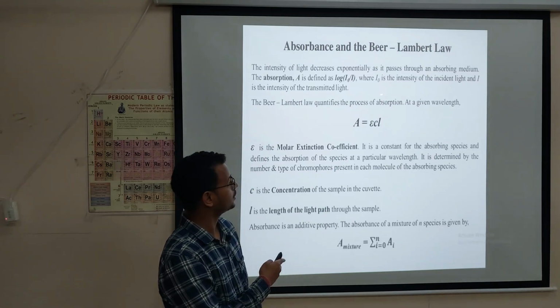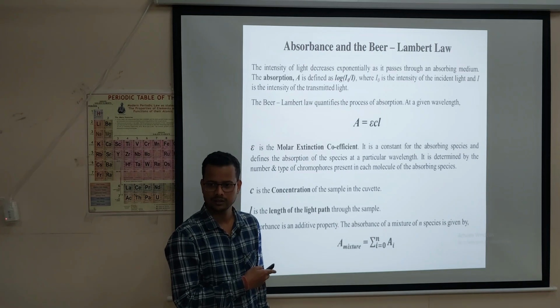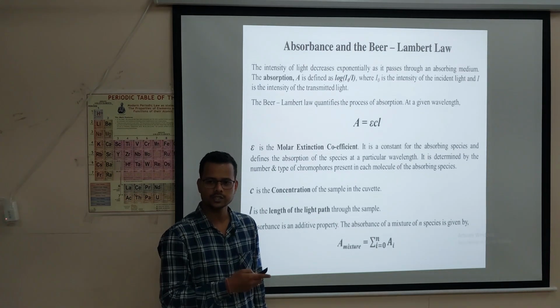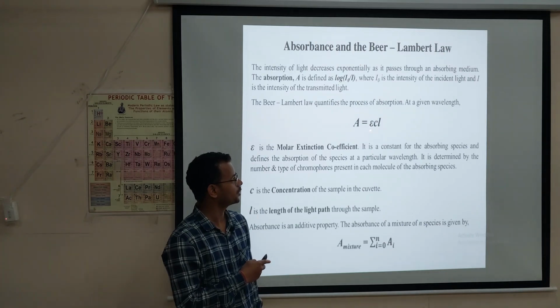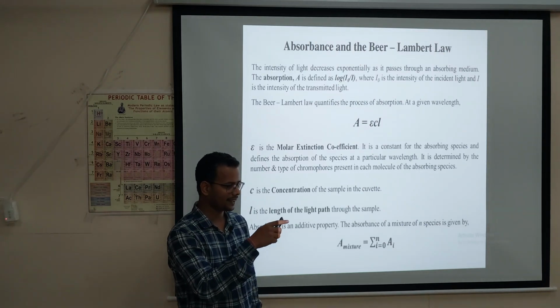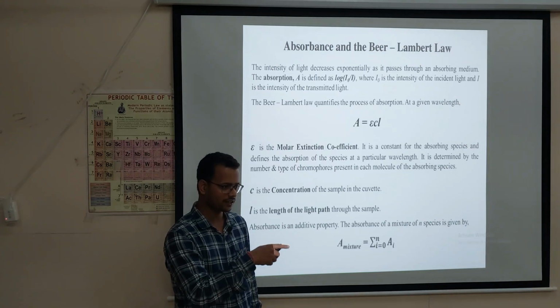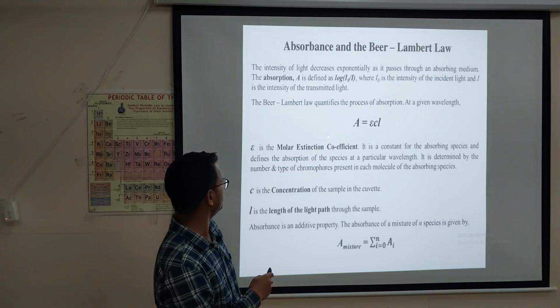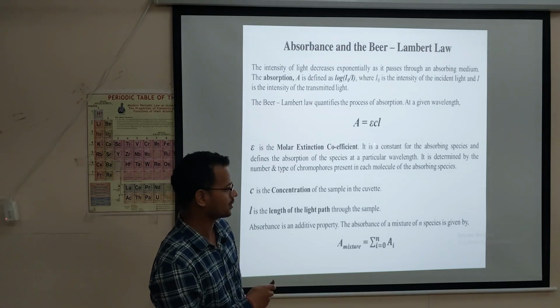So this is the basic formula, Roshan. Yes. You know what K is here? We just put epsilon as a constant here. What we are telling is that the value might be K by something, that we just take here as epsilon. Just epsilon here, the absorption constant, right?